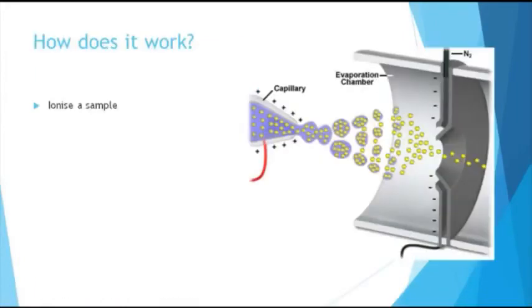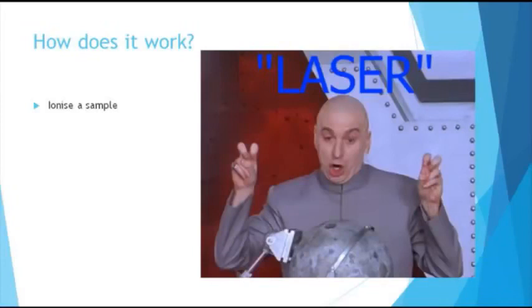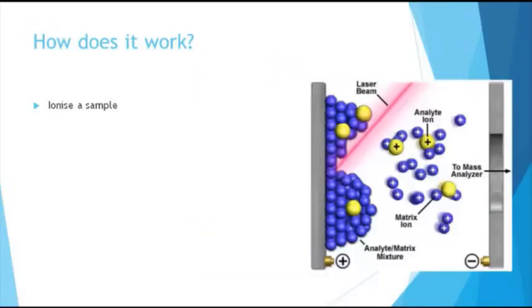The one I came across quite a lot is called electrospray. So what you do is you get a charged nozzle, and you squirt your sample through there. And as it goes through the nozzle, it ionizes because the nozzle's charged, but it also disperses. And then you funnel it into your detection thing. So that's quite a crude way of doing it. It works, but it's cheap. My favorite is using a laser, obviously. And in this, you get your sample, you hit it with a laser beam, and that causes the ions to break off. And then you direct those into your machine.